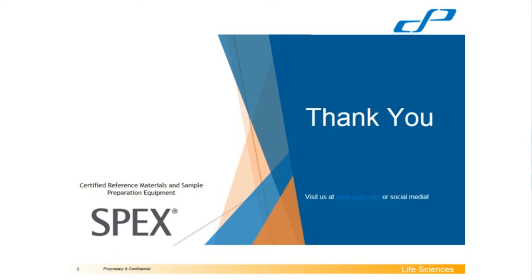If you are doing minute PPB work or you're doing research work and you need no contamination whatsoever, then yes, you can invest in an LCMS grade of solvent. The best advice is to try it out and see if it works for you. There might be no difference to your work at all, and then you can save the money and use an LC solvent. Or you might find for the particular work you're doing, you need that extra layer of filtration that they give, that ionic filtration, and then that's something you need to invest in.